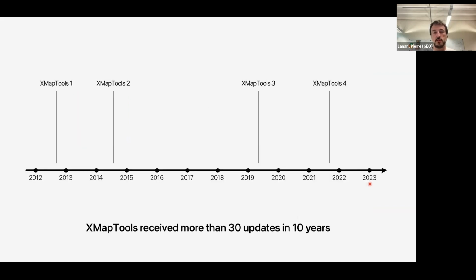This is just to show you the development. It has been now a more than 10 years project. I started when I was a PhD student, and then I released XMapTools 1 at the end of my thesis. It evolved over the years.